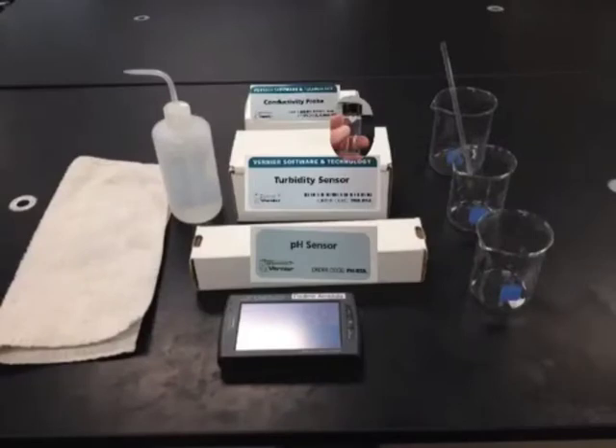Hello, this is Mr. Buss, and I'm going to walk you through how to do Lab 14 on water treatment.